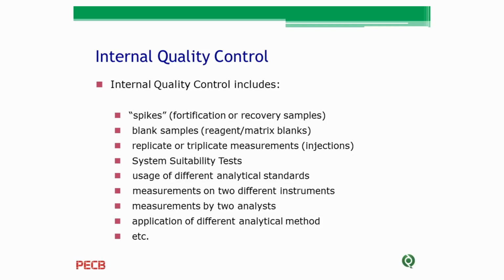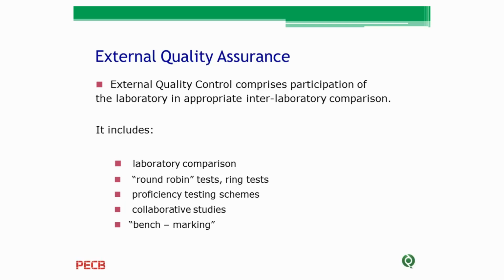So the whole package of these activities can be done in a laboratory in specified time intervals to enable the laboratory to be sure that they produce technically valid results, as I mentioned. When we talk about external quality assurance or external quality control, usually we talk about inter-laboratory comparisons. Sometimes these inter-laboratory comparisons only involve a very small group of laboratories. Sometimes a large number of laboratories participate in such comparisons.